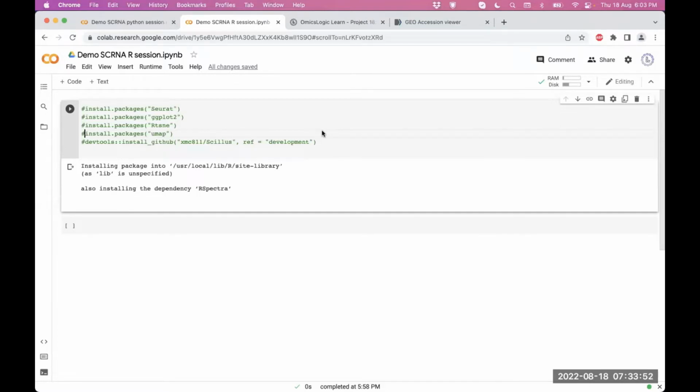So if you have not set it up, quickly you can do this by typing colab. Wait a second. We will share the codes that we are going to explore today. Let me give the link: if you type colab.to, then you can go to Colab's environment.